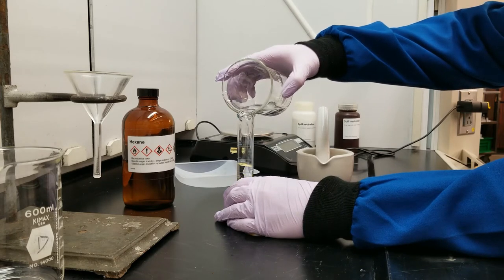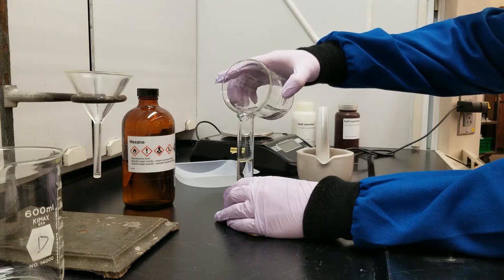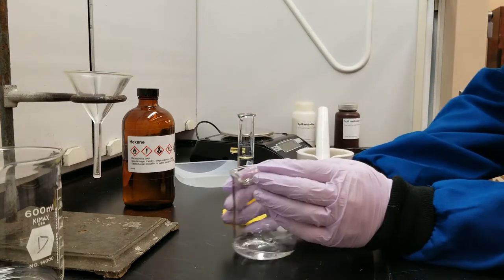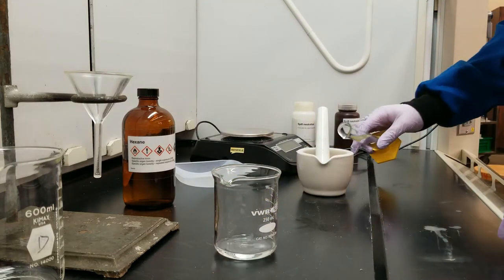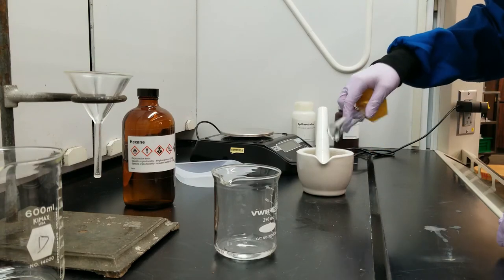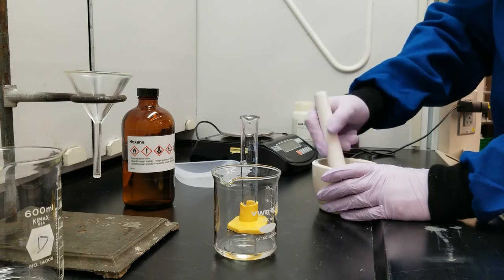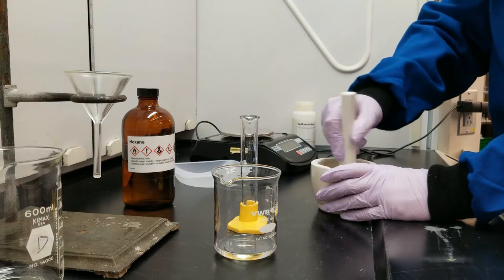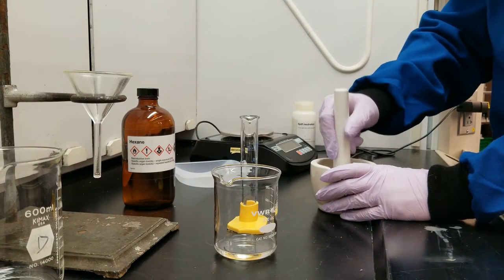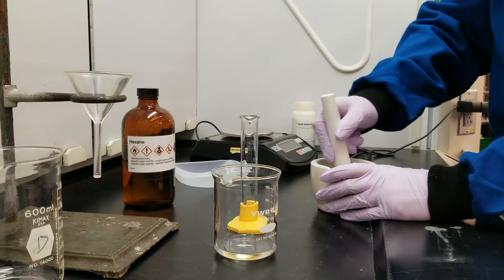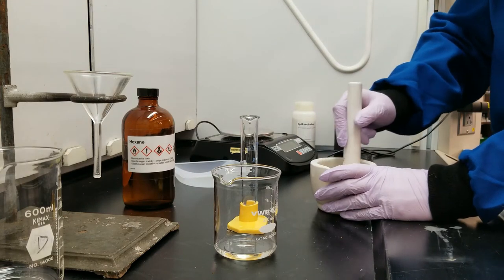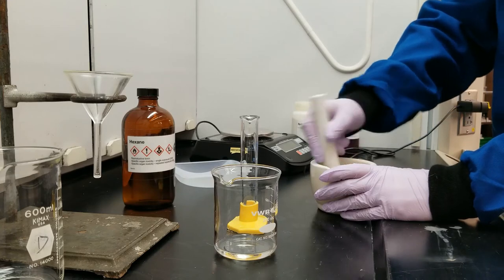I'm going to measure out about 20 milliliters of hexane, and I'm going to add that to my mortar. And then I'm going to continue to grind up my potato chips for about a minute.